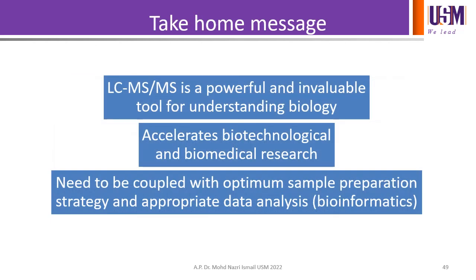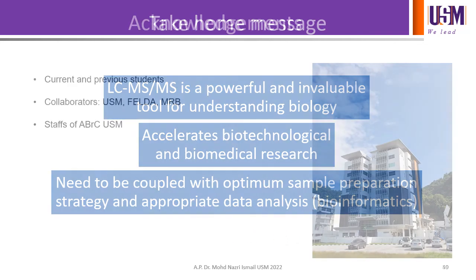Alright, I'm almost at the end of my presentation. So the take-home messages are that LC-MS is a powerful and invaluable tool for understanding biology. It can accelerate biotechnological and biomedical research. However, it needs to be coupled with an optimal sample preparation strategy and appropriate data analysis, which is specifically bioinformatics.